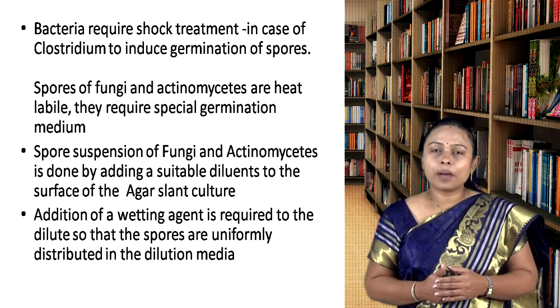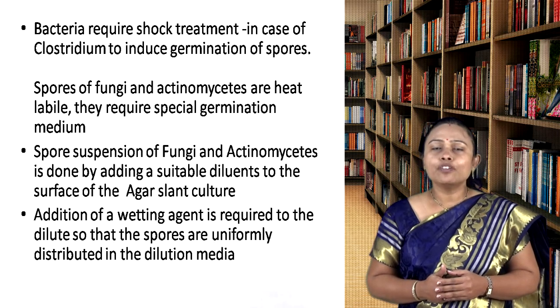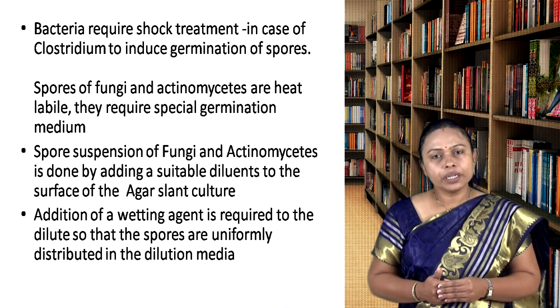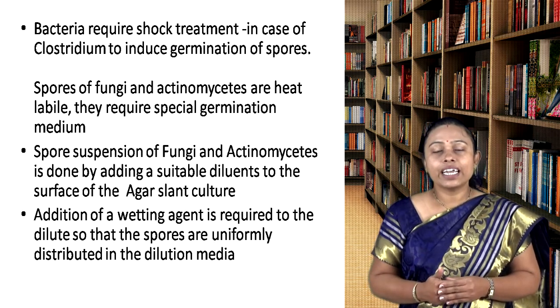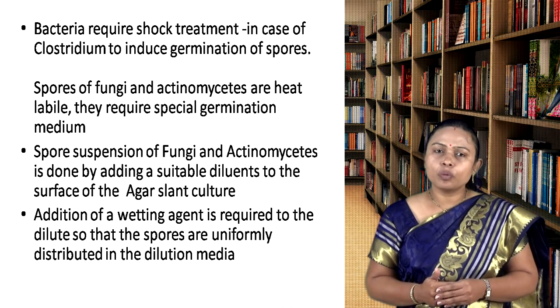If cells are bacterial cells or spores of fungi, they are first suspended in sterile tap water for transfer into the liquid inoculum medium. The bacterial spores often require shocking treatment, like in the case of Clostridium, to induce germination of spores.